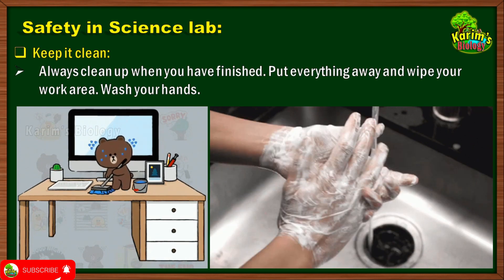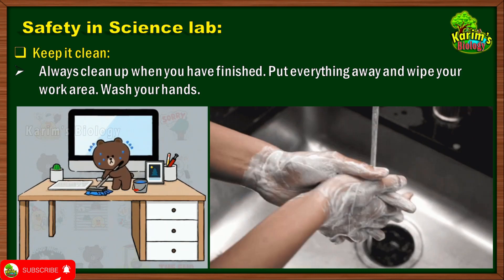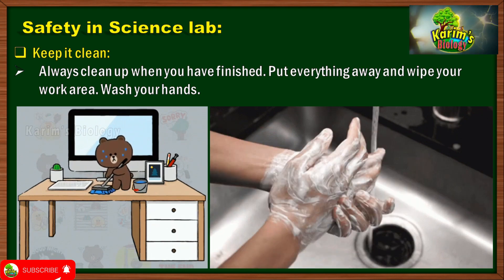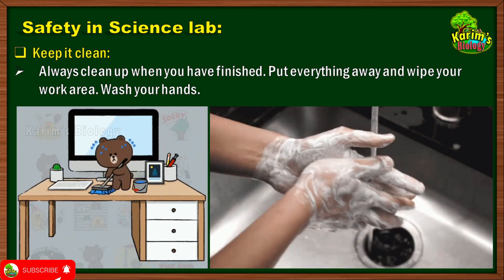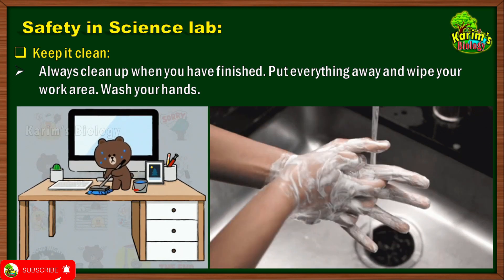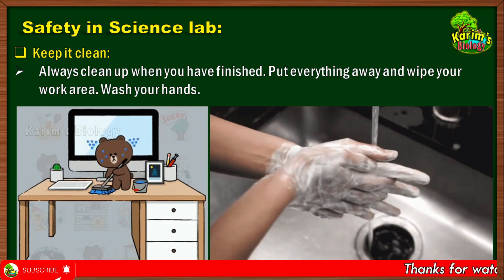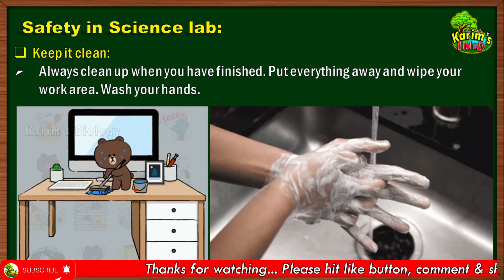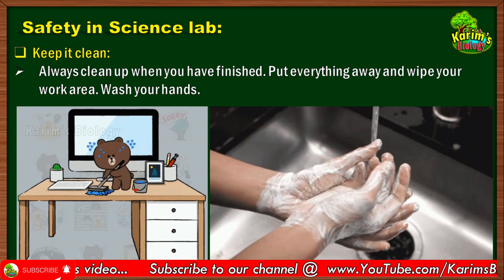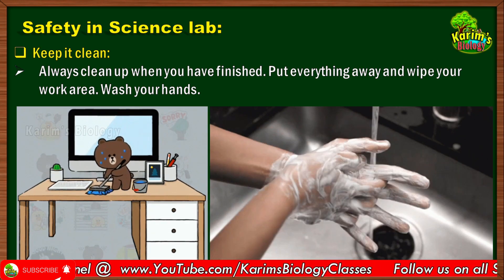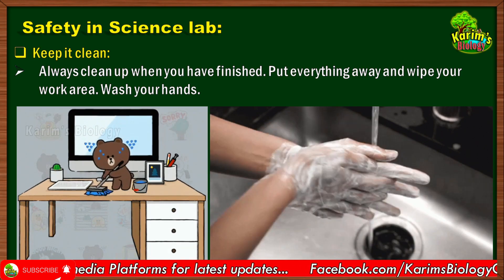The next safety precaution is: keep it clean — always clean up when you have finished. Put everything away and wipe your work area, then wash your hands thoroughly. After completing their experiment and making observations, many students get busy analyzing results and forget to clean up. When leaving the science lab after completion of the experiment, you must put everything away in its proper place, clean the work area with water, and wash your hands thoroughly with soap so that any germs or chemicals are washed away.